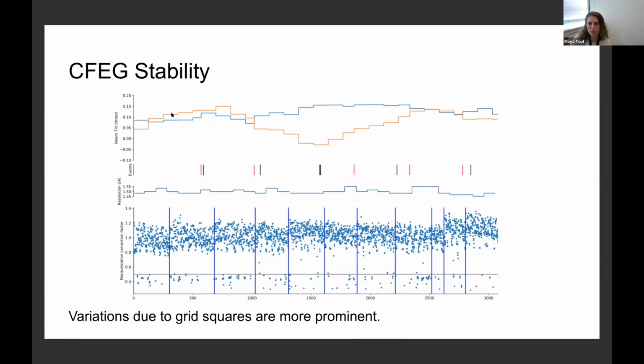Okay, thank you. TJ Regan is asking regarding the fourth order aberration correction every few micrographs. Does this mean that Cs or pixel size is changing over time? Actually not. For this one, the Cs, pixel size, magnification does remain very stable. The reason I did this grouping is simply because I wanted to do the beam tilt, and then I grouped particles, then everything gets grouped, defined as such optics groups along the way. So for tetrafoil, you actually don't have to do it in such small groups.